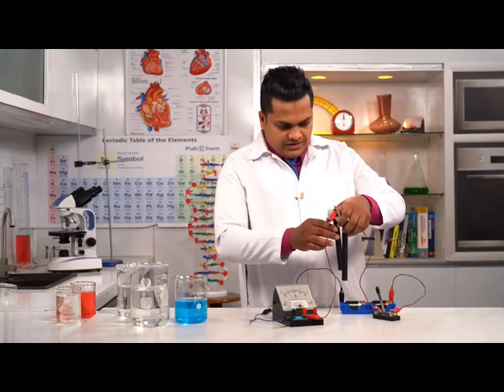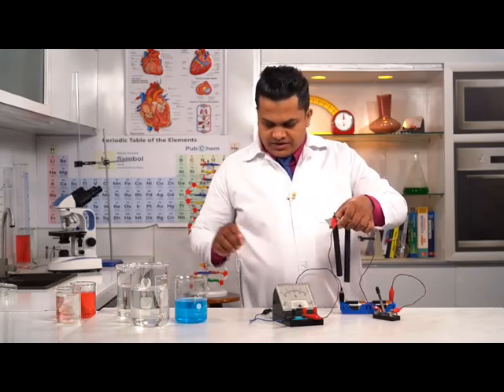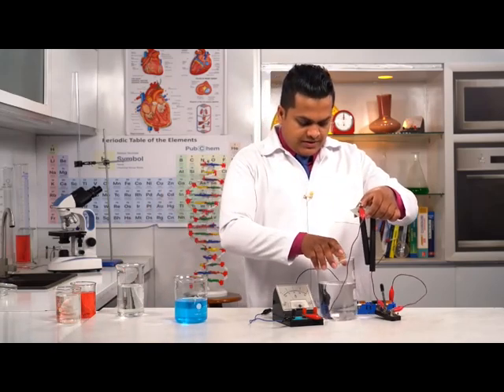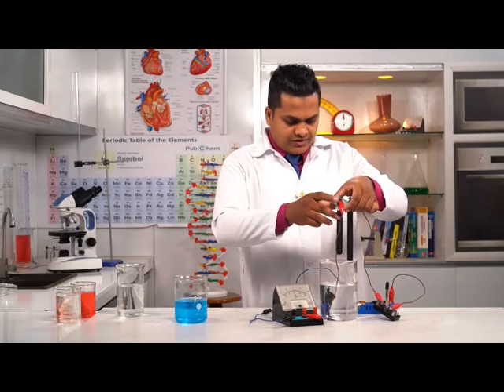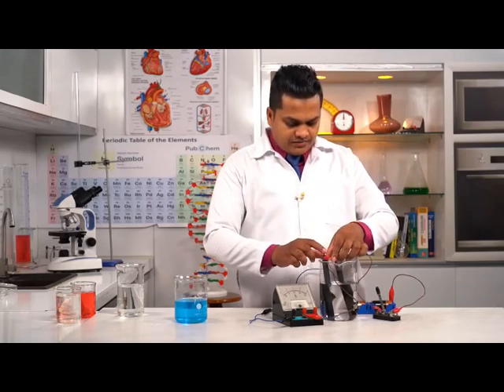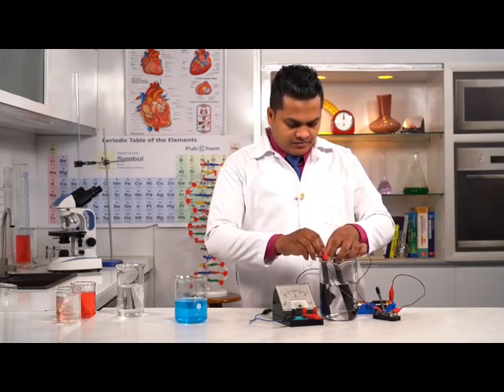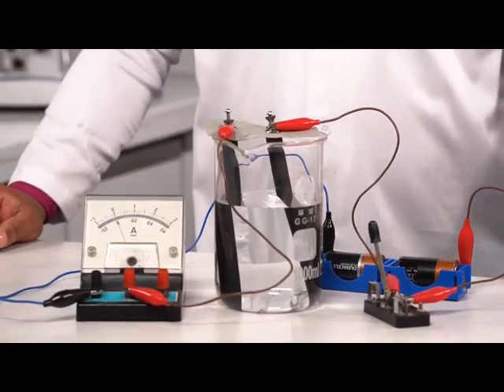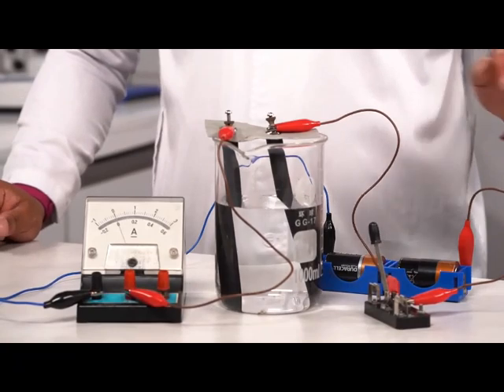The next one which I am going to take is distilled water. So let's insert the two carbon rods into the system that has distilled water. Here we go. Now let's turn on the switch and observe what's going to happen.